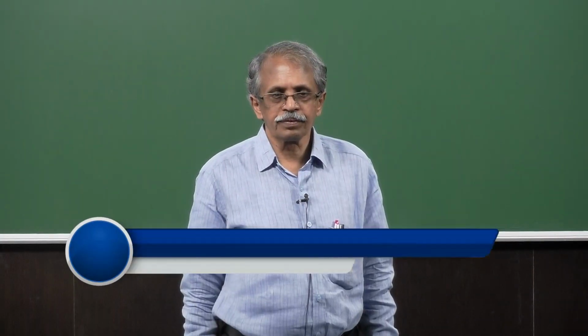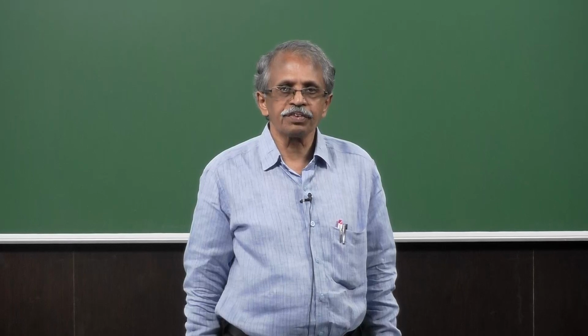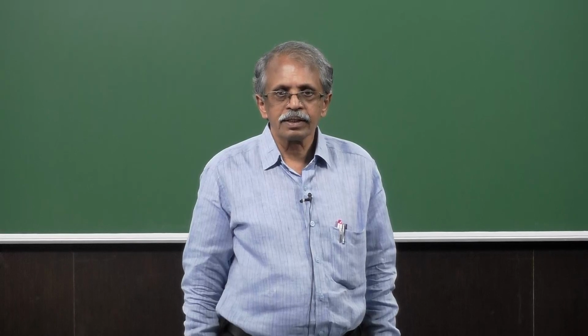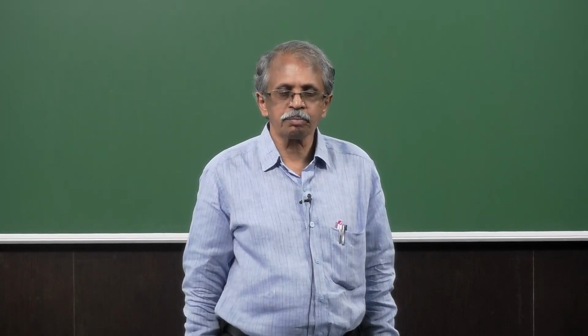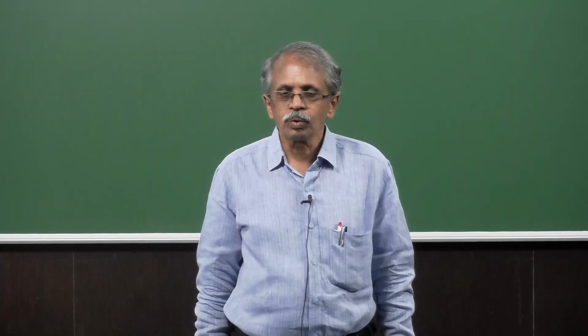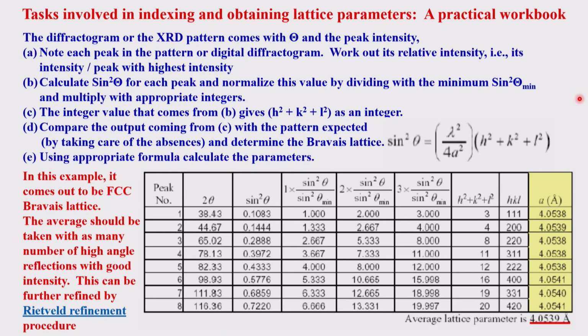Good afternoon, everyone. Welcome back to this course on analytical, spectral and microscopy applications of inorganic compounds and nanomaterials. We have been discussing in the previous classes the role of XRD, powder XRD, particularly in characterization of materials, identifying the phases both in the inorganic and nanomaterial aspects. Over the two previous classes we have run through all the basic concepts related to powder XRD, which is also known as the polycrystalline XRD.